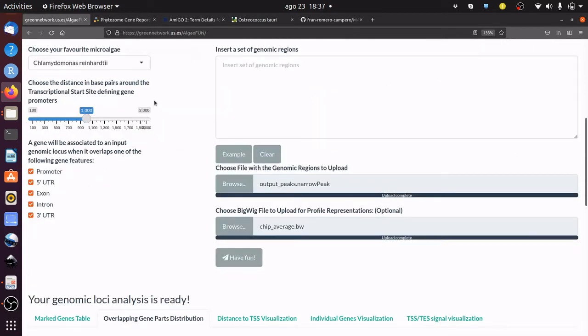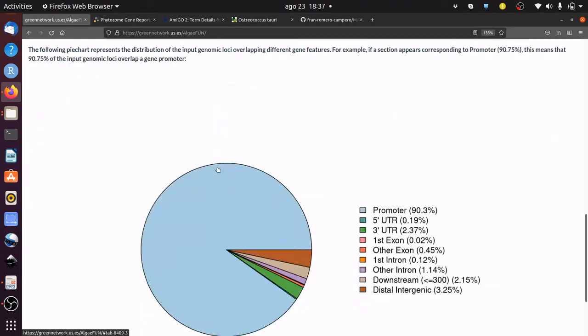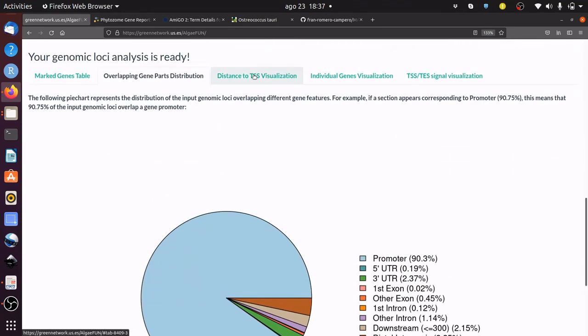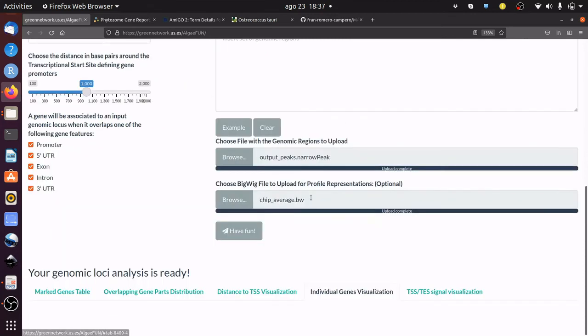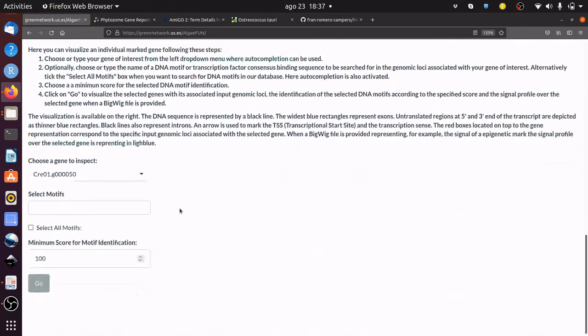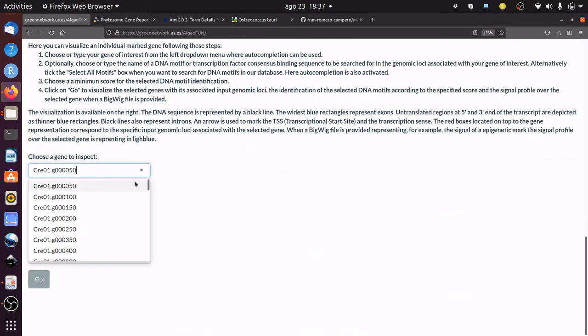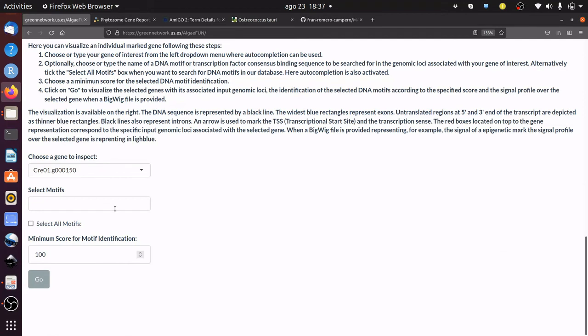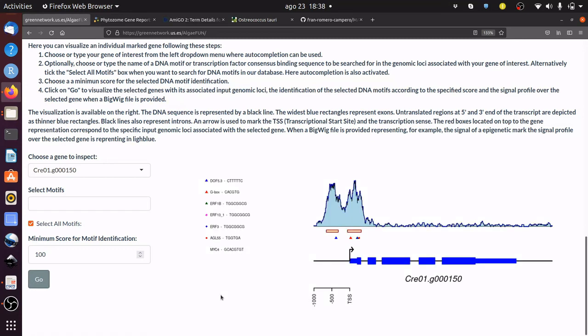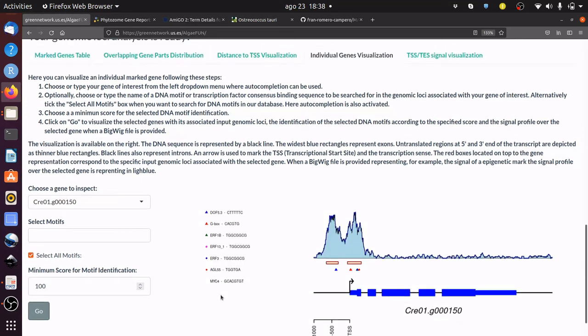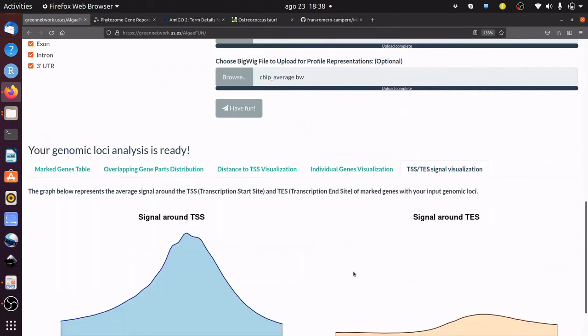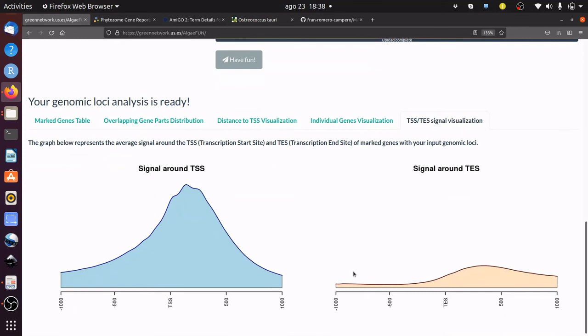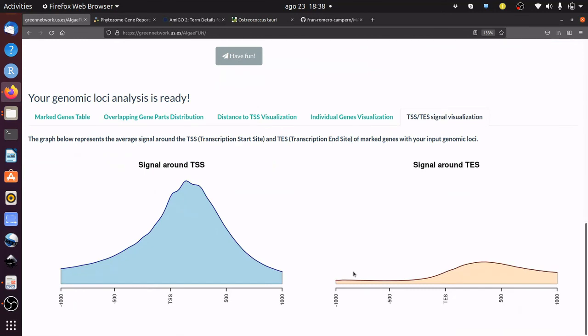The distribution of gene features overlapping the input genomic loci and their distance to the transcription start site can be visualized as well. The signal of individual genes and DNA binding motifs can also be analyzed. Finally, the average signal around the transcription start and end sites for all target genes can be visualized.